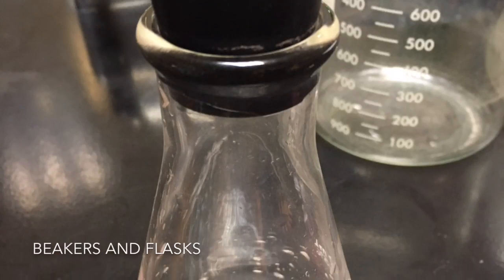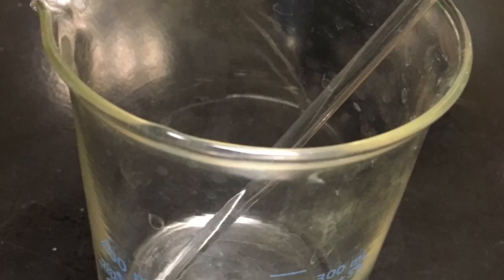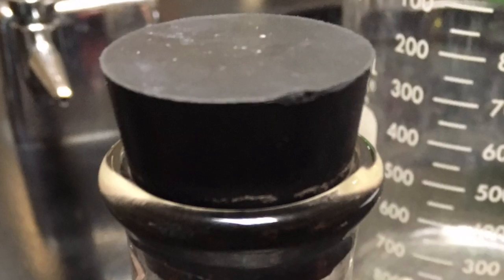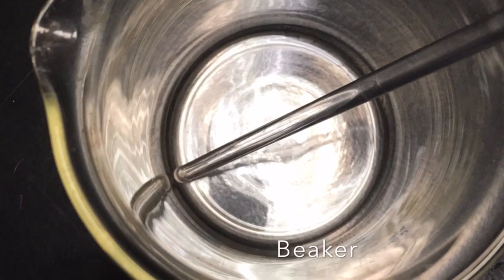A beaker and flask both measure volume. The unit used is milliliters. The difference between the two is that a flask has a narrow end and comes with a cork. The cork seals the top so that nothing can leak through. This cork is the reason that you might choose a flask over a beaker. A beaker has a wide end and is open.